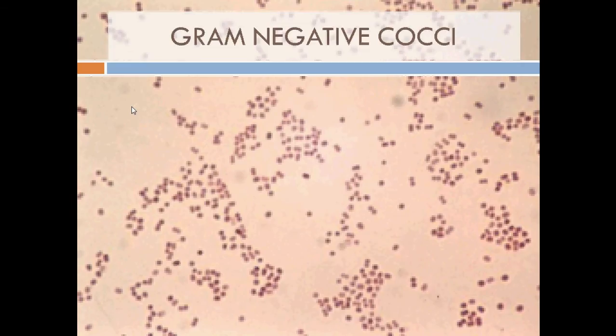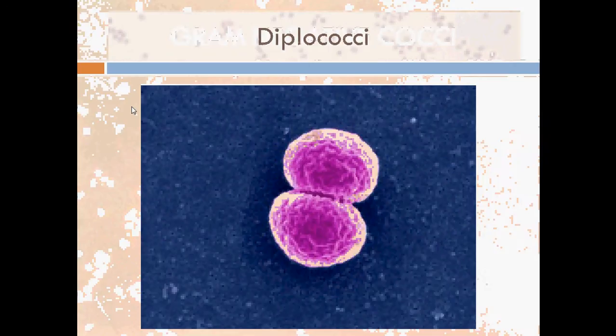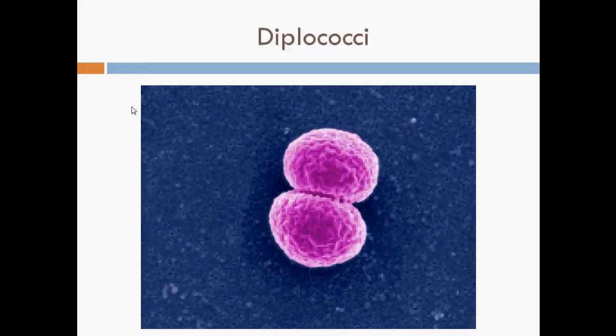Hello everybody, today we are going to look at gram-negative cocci. These are bacteria that take up the counter-stain safranin instead of retaining crystal violet, hence they appear pink under the microscope right after gram-stain. The bacteria we are going to look at take up this particular morphology called diplococci, which means paired spherical bacteria.